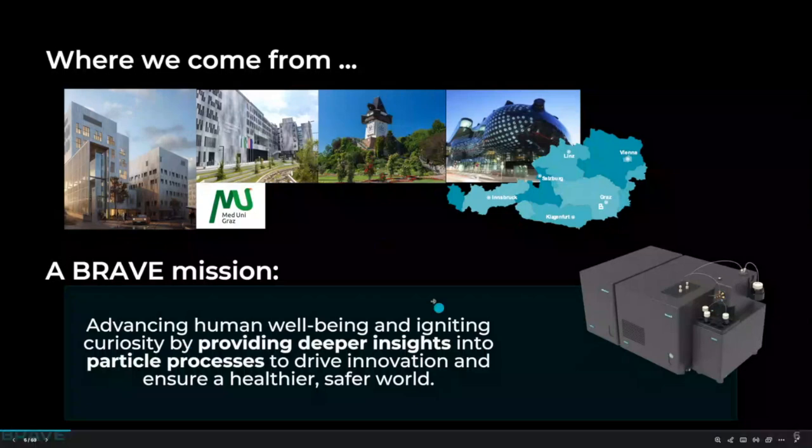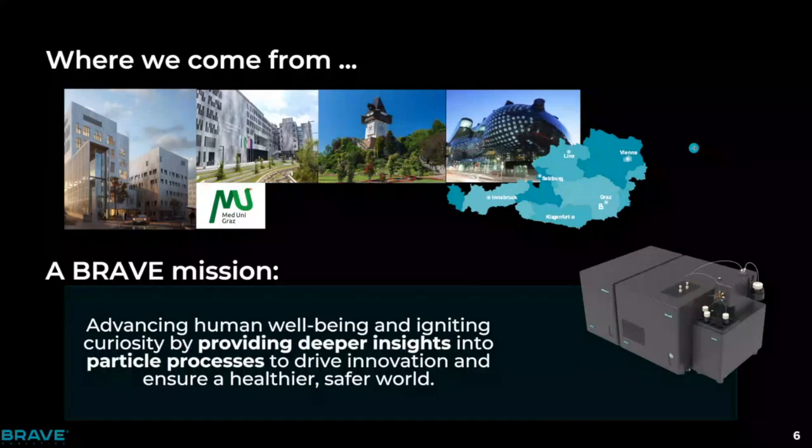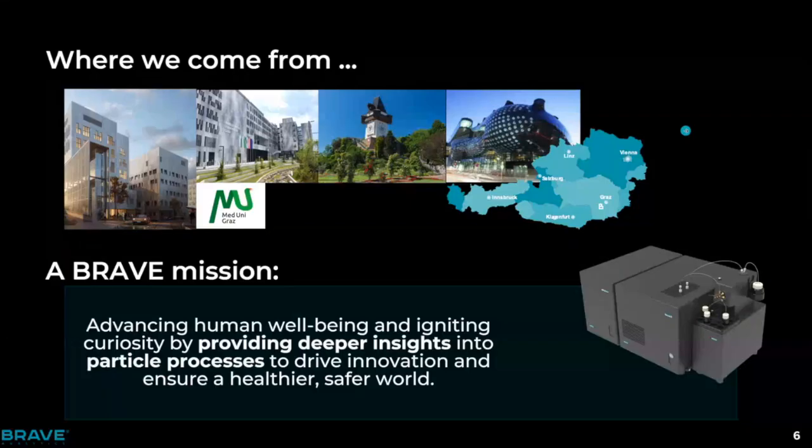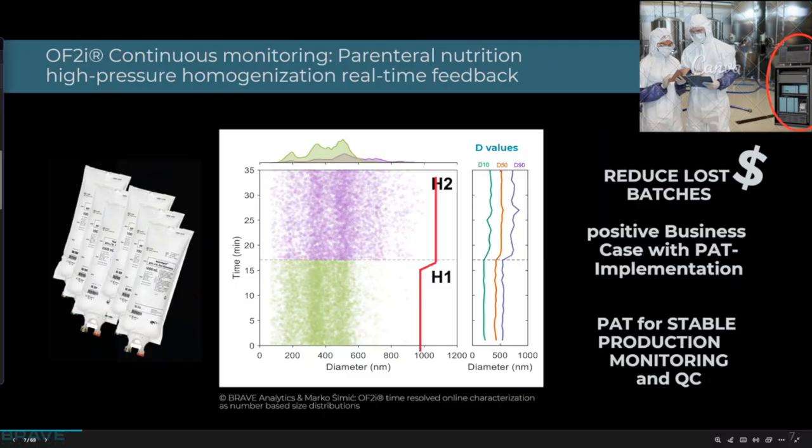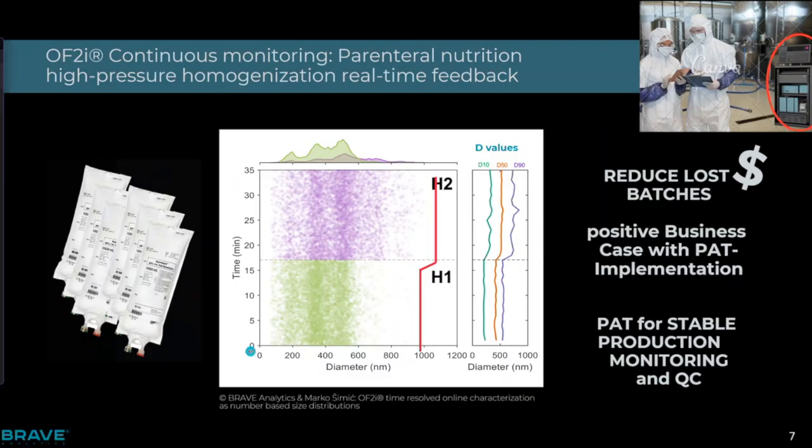I think right from the beginning, this topic fit our mission, but it was not how we started out. At the beginning, we really looked into pharmaceuticals, and we are still looking into pharmaceuticals. So production of infusion or parenteral nutrition was one of our topics to really look into nano characterization over time, so-called PAT sensors, where we have single particle based information on liquids containing particles.